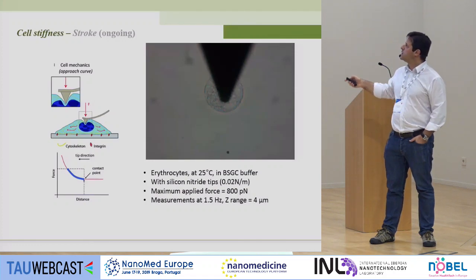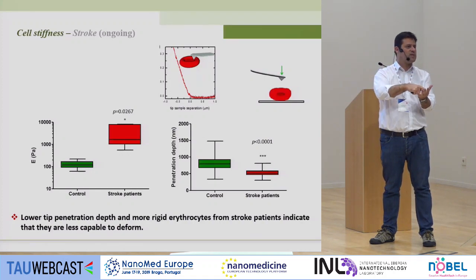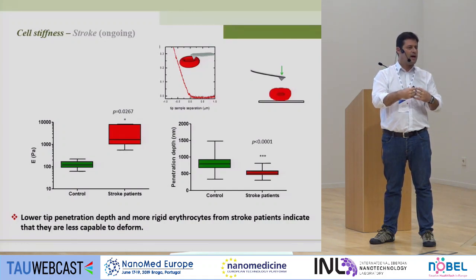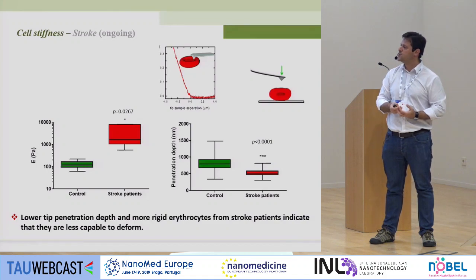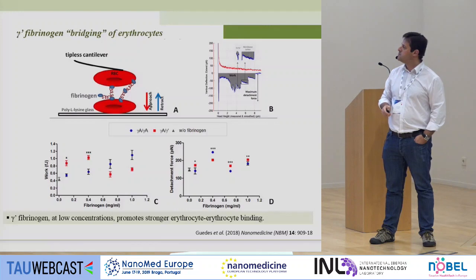And we could see that there is also increased rigidity and the lower penetration depth of the AFM tip on these cells, and this can also be used for the assessment of the patients. Just a quick note on two other studies.